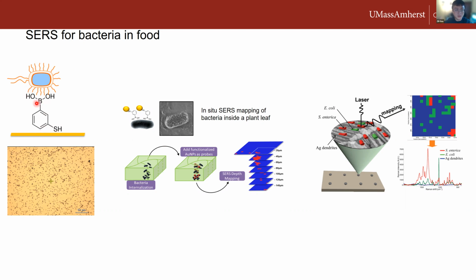And the group right here could bind with the cell surface or the bacterial wall surface under alkaline condition. With this, we can optically see it under the microscope. And since the bacteria is very close to the gold, we can also measure this by Raman spectroscopy.